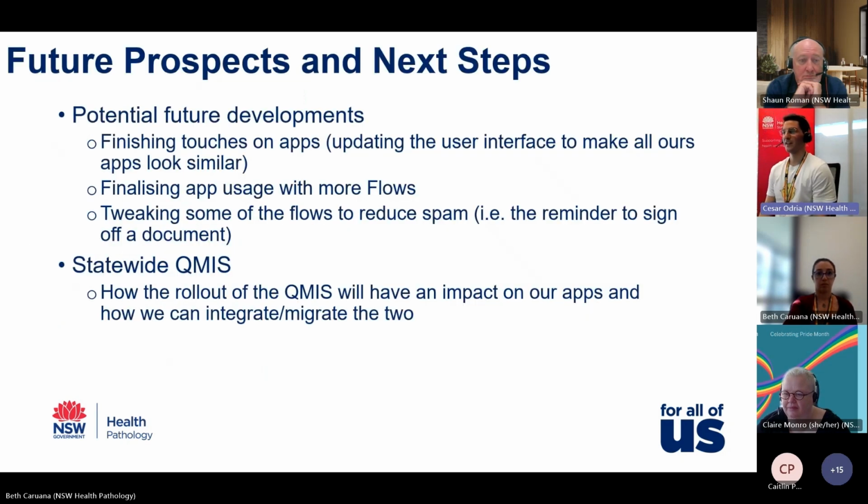So future prospects and next steps for us. We want to update our apps to make the user interface look much the same or similar. We want to finalize the apps to include more flows so we can automate more mundane tasks and tweak some of the flows to reduce spam.